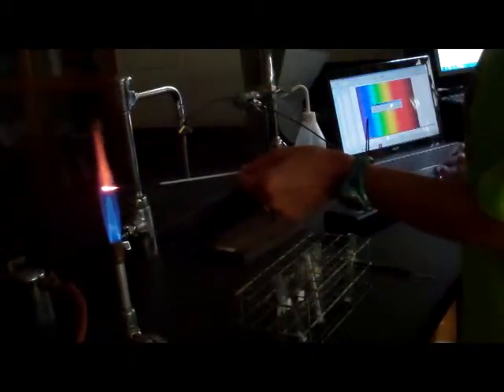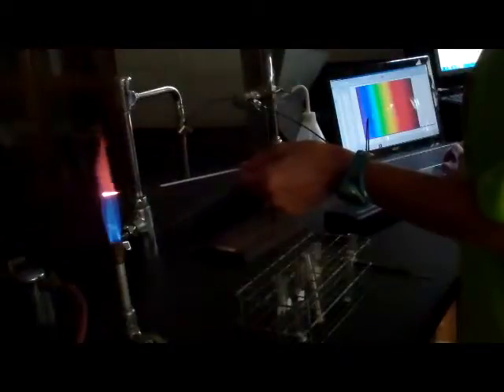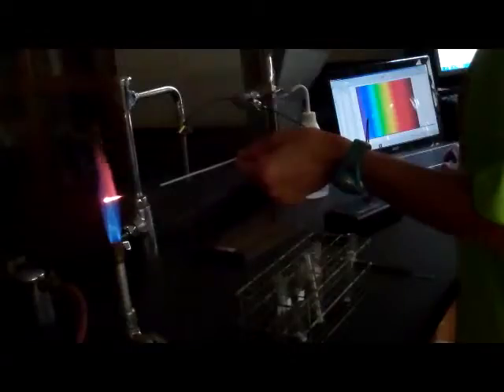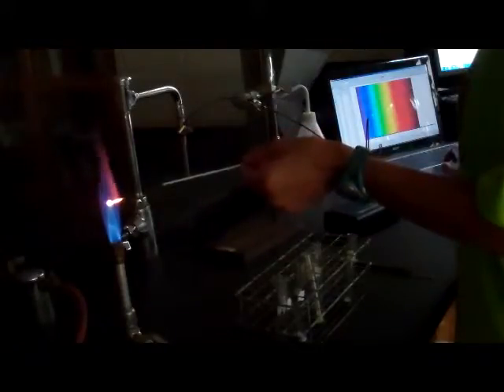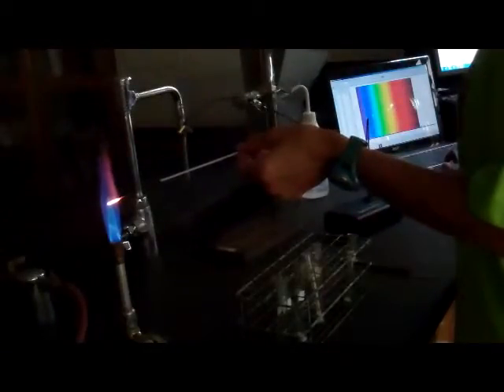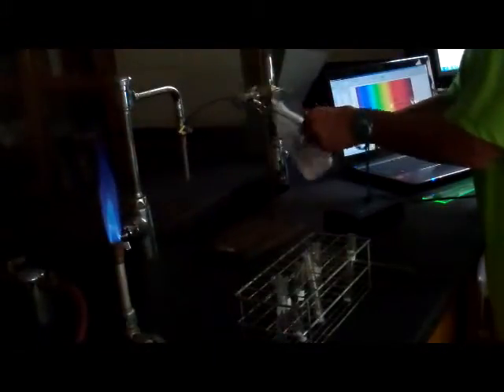Store the latest run. Stop, rinse our loop. We hopefully took note of those colors.